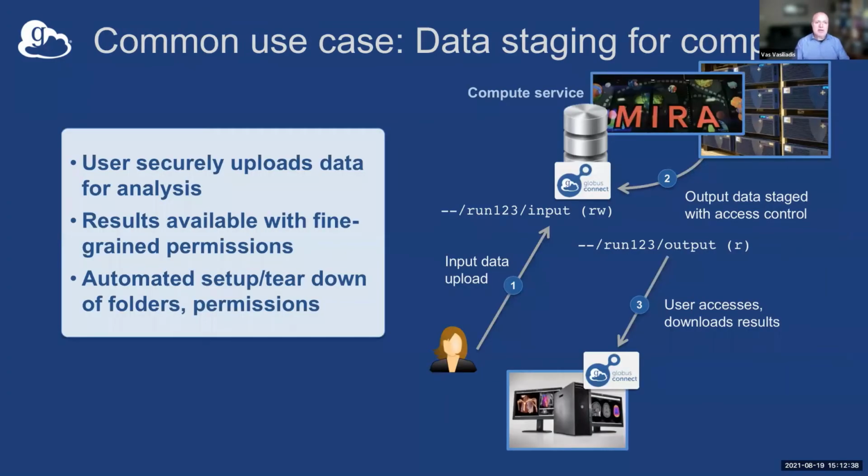Another common scenario here is being able to stage data for compute. So you may have a script that pulls data off the instrument, puts it, as part of a staging command, to run some high throughput computing or other job on some resource, and then does a stage out. The stage out command might actually put the data elsewhere for you to look at and analyze further. So progressively you can automate more and more of this end-to-end process and do it at increasingly higher scales.